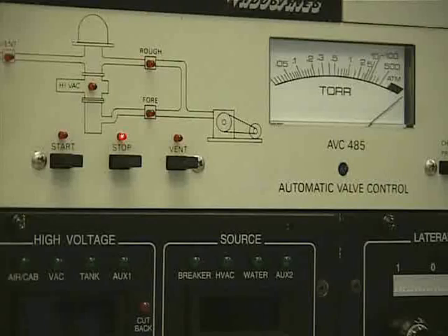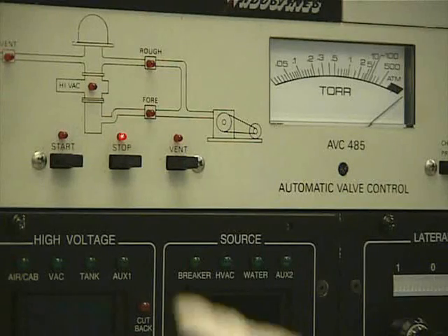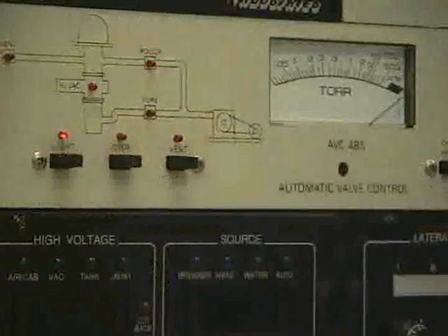After removing your sample and loading the cage we need to pump down the system. We pump down the system by pressing the stop button and then the start button.